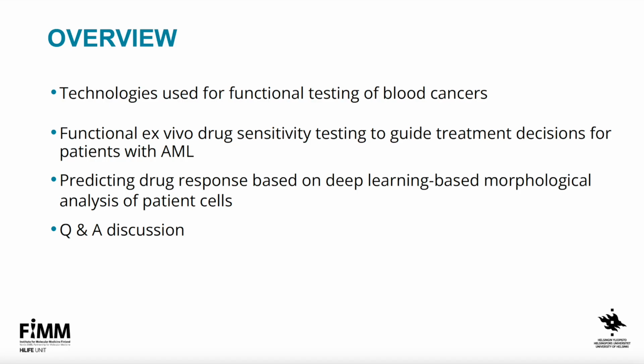But then I also want to show you what we recently were able to do using the Deep Cell technology with the REM-I instrument and also the human foundation model that Megan just described, and which is, I think, pushing our research into a new dimension. And it's really exciting. I look forward to continue down that path.